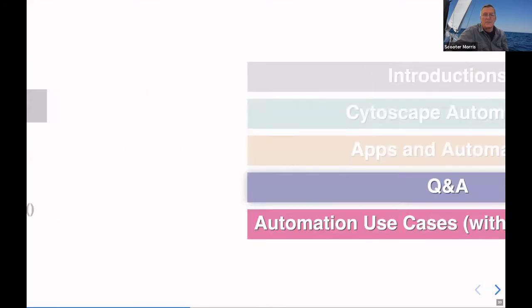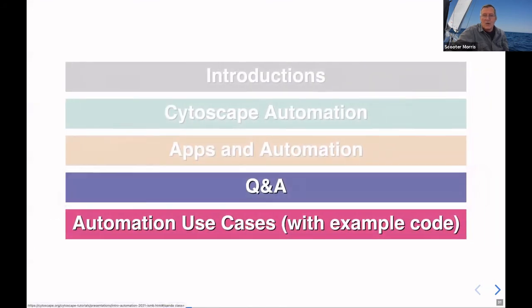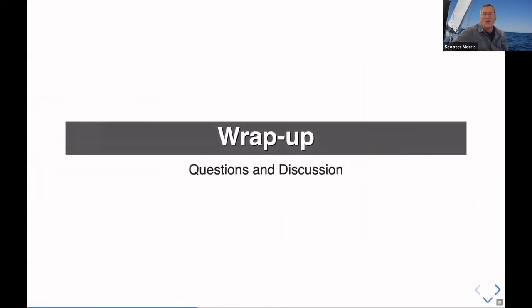Okay, so questions. Does that all make sense? So my understanding is that if you need to do some commands, you just write it in R, then this command goes to Cytoscape, then you retrieve the result from Cytoscape to R again, or is this correct?